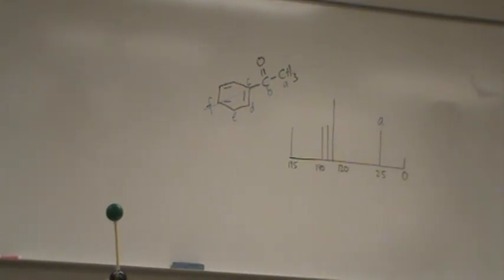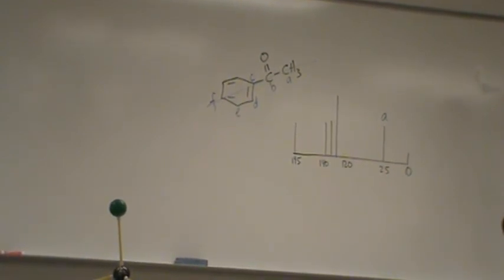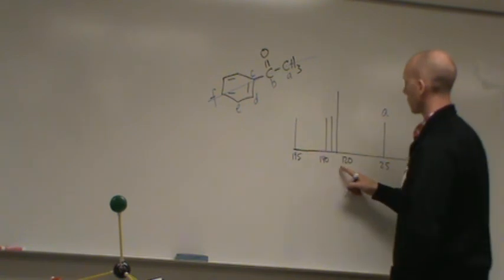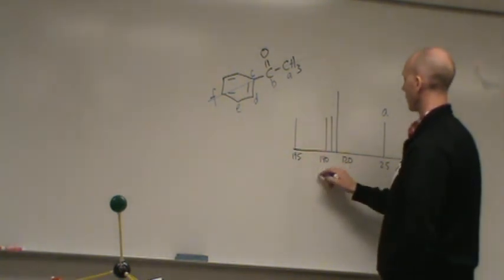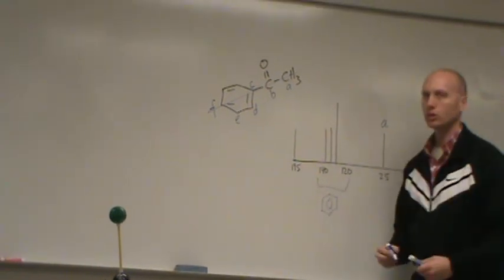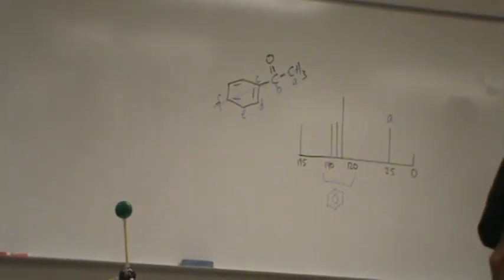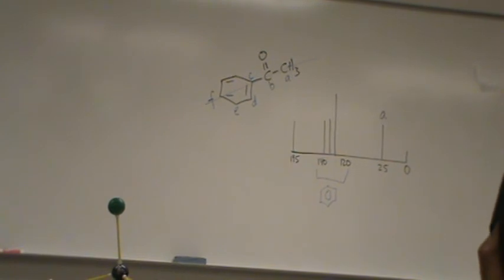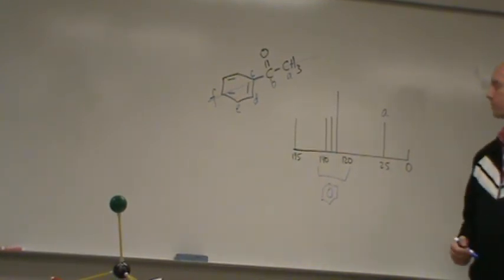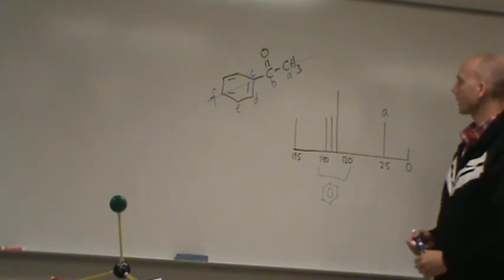Okay. Benzene carbons, remember benzene is a de-shielder. Benzene carbons always show between 120 and 140. Okay? Just like in Proton NMR, they show between 7 and 8. Here's the signature on C13, 120 to 140. Okay?